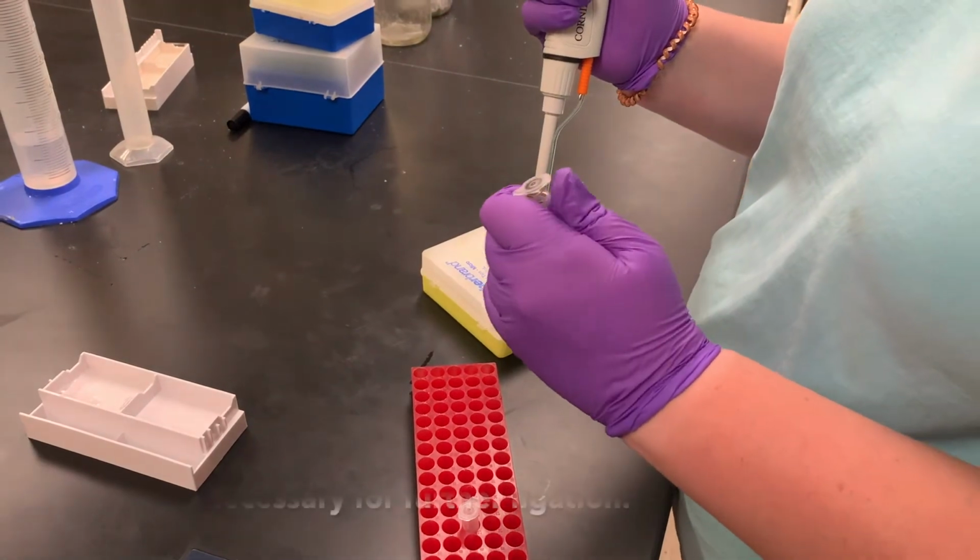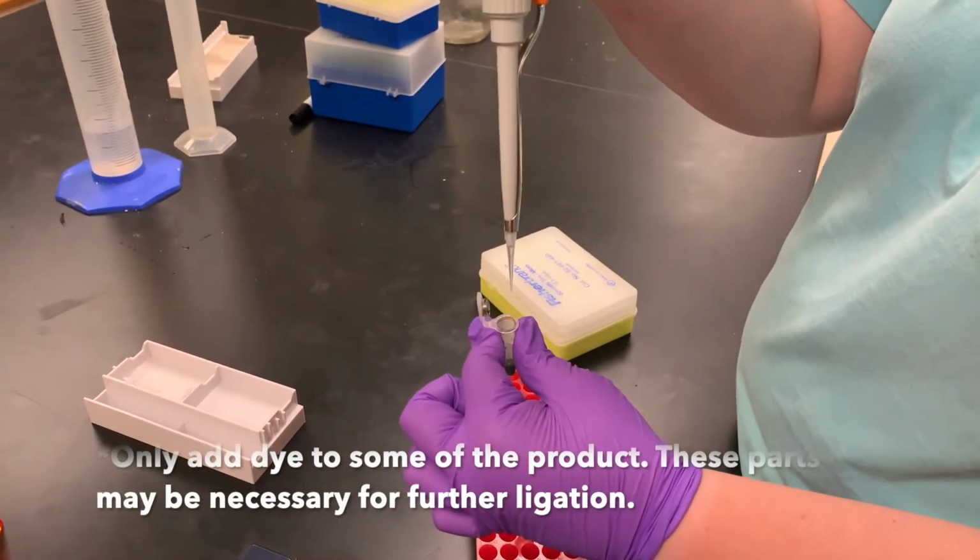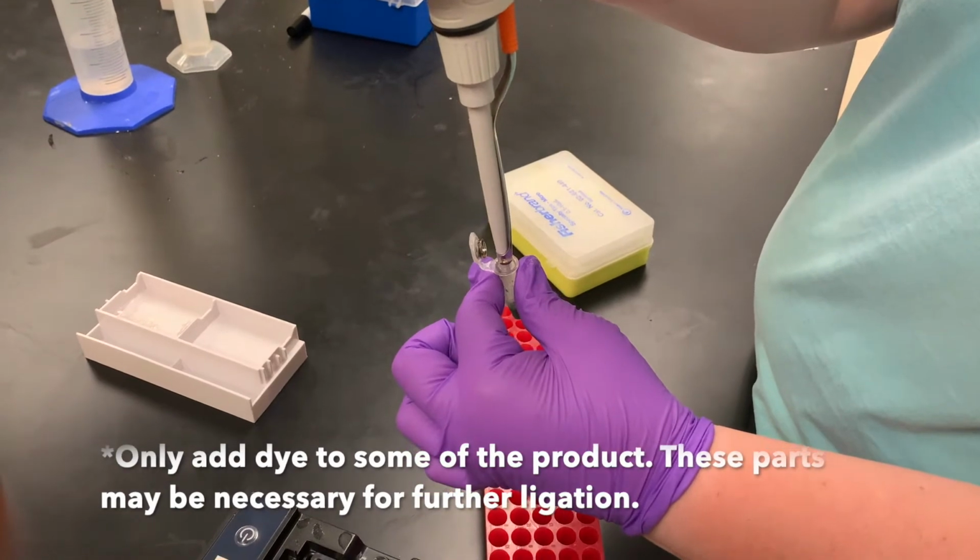Add 1 microliter of purple loading dye to every 5 microliters of product. This will weigh down your product and keep it in the wells.